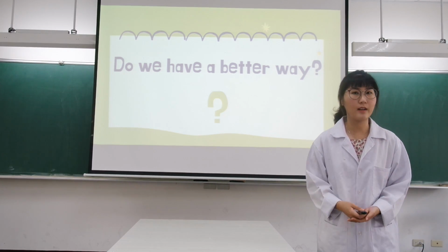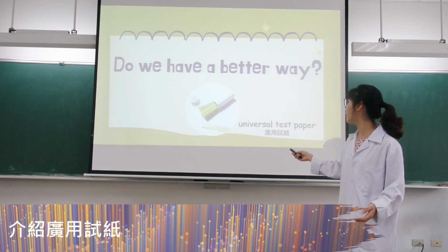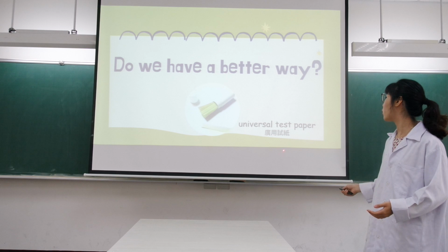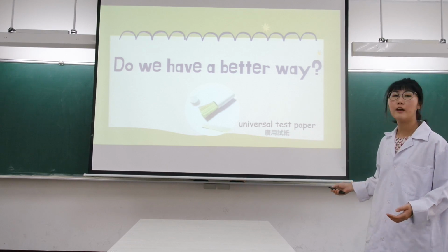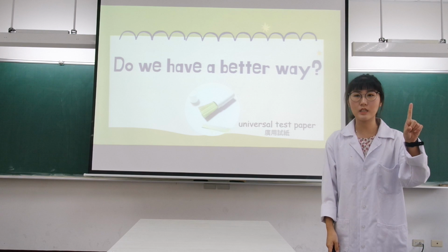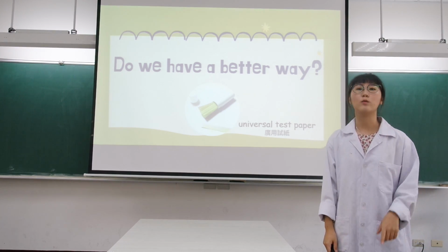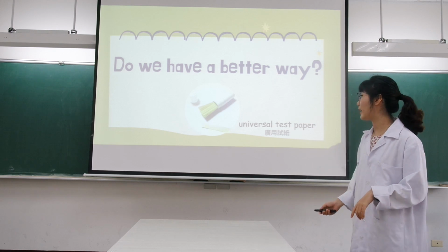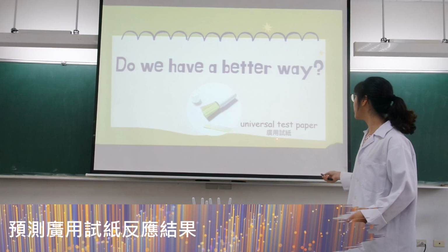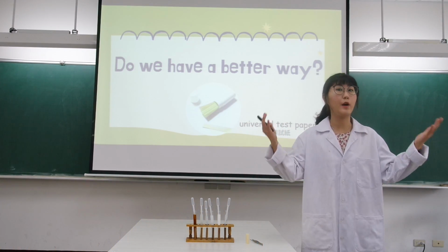How can we improve it? Scientists invented the universal test paper. There is a kind of test paper called universal test paper, and just like Yvonne said, we only need to test once to know the result. So we only need to do it once, and then we can know the result. If we use the universal test paper to test the solution, what will happen?